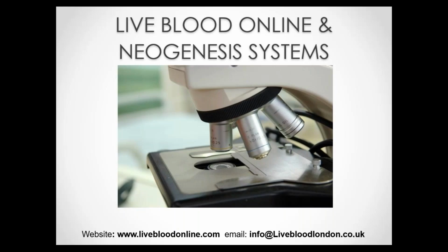The condensers always have to be removed to be changed? Do the condensers have to be removed to be changed? Yes, absolutely. So they're interchangeable. So for bright field, you would have the bright field condenser under the stage, and then going to dark field, you would have to remove the bright field condenser and place the dark field condenser under the stage.